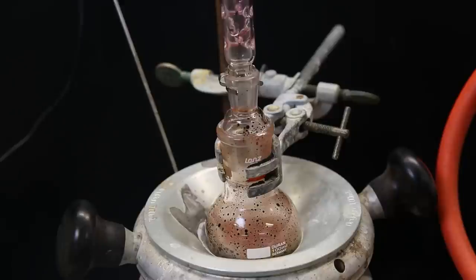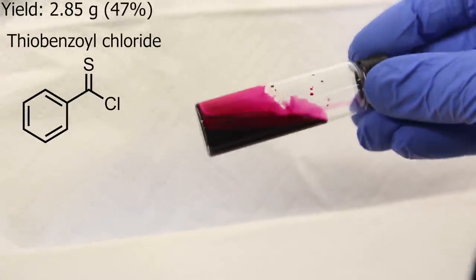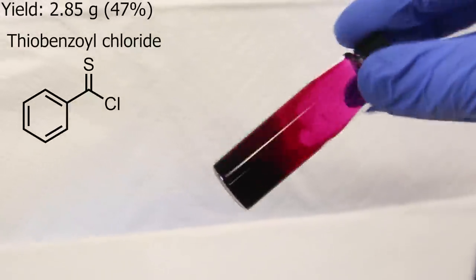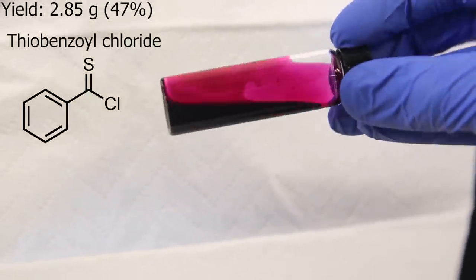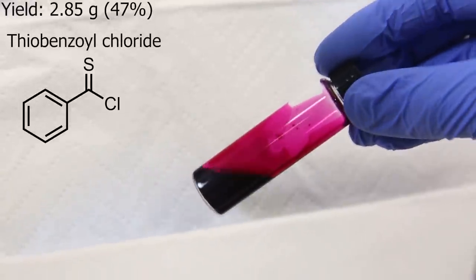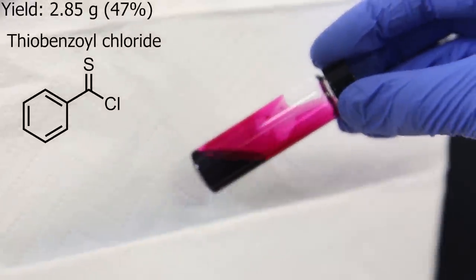I transferred all of the product to a vial, and the total yield turned out to be 2.85g, which is 47%. This is exactly the same as the paper I was following. Besides being pretty, thiobenzoyl chloride is also useful as a reagent for making thiono esters, in a simple way.